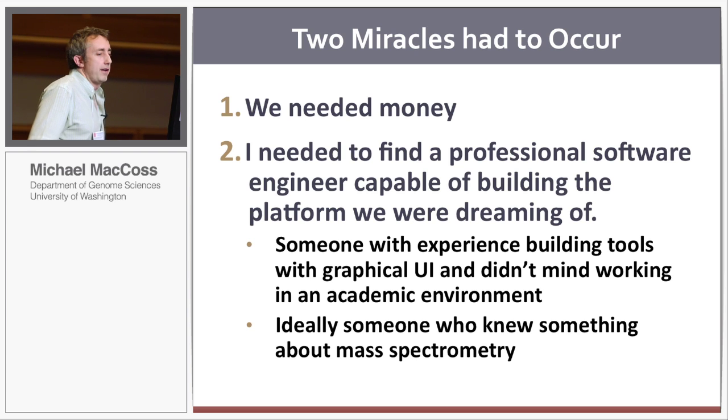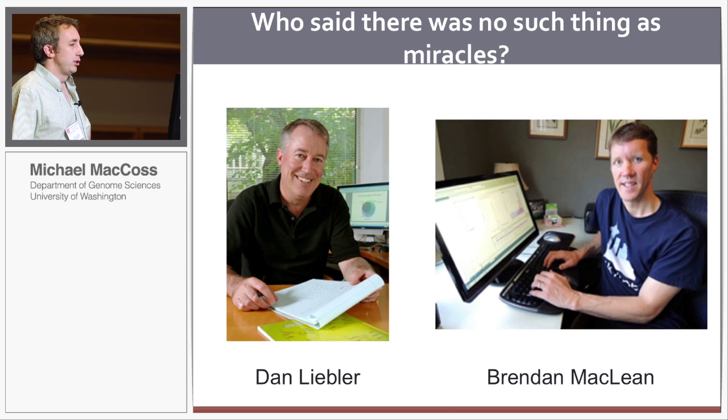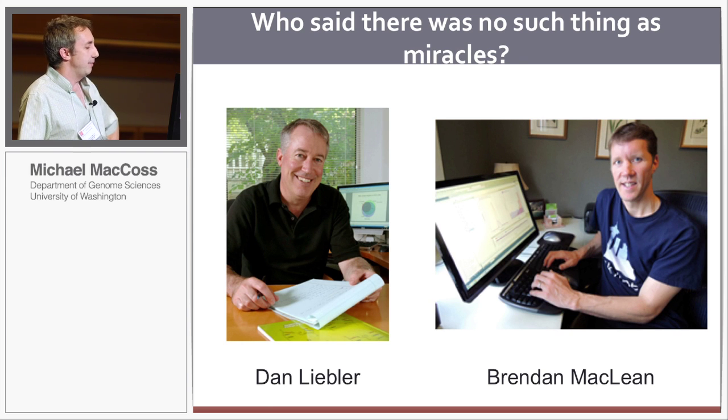We wanted to have a graphical user interface, and ideally, this makes it even more challenging, someone who knew something about mass spectrometry. So who said there was no such thing as miracles? It was actually really quite amazing.